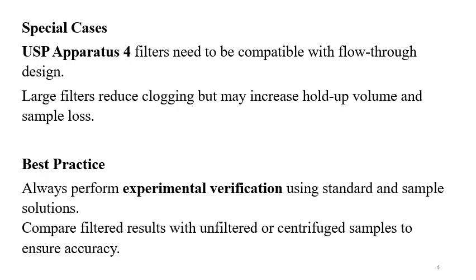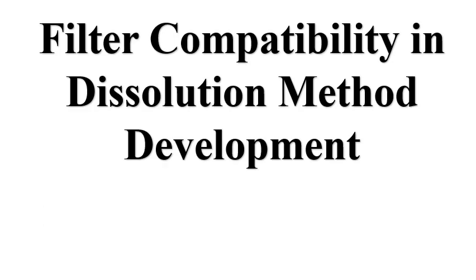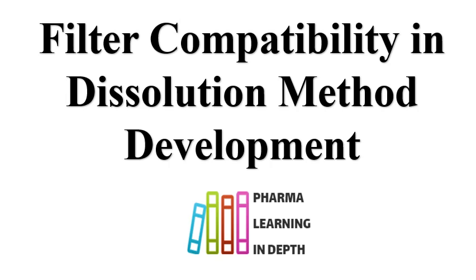Once you are done with the filter compatibility, filter selection, this technique can help you to understand the effect of filters. So this is the information about filter compatibility in the dissolution method development. Various types of filters are available and these are required to be selected considering the scientific rationales.